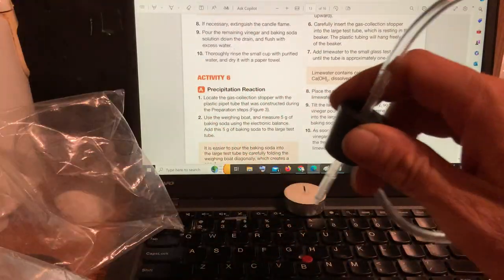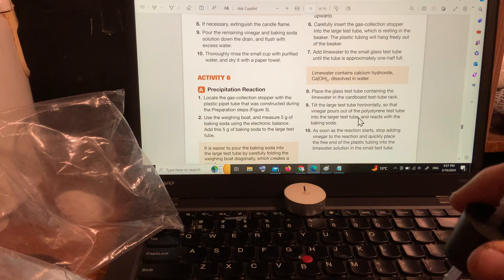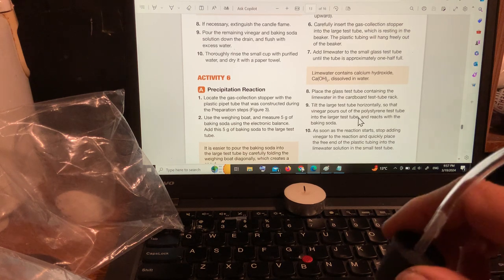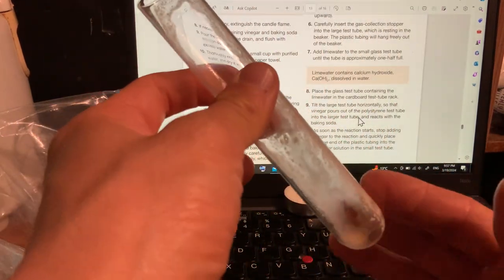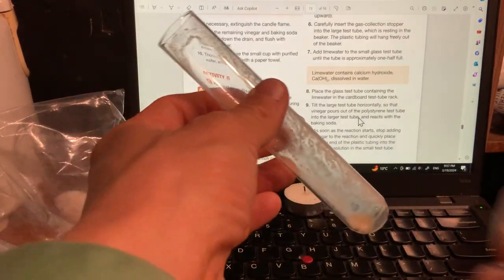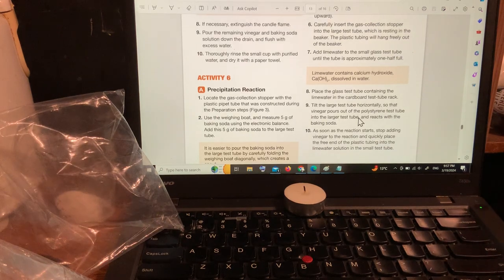Okay, large test tube. The large test tube is the same one you used in the activity about hydrogen peroxide and yeast. It's the large glass test tube. Same one. Let me clean it out with some water. Clean it out like this.